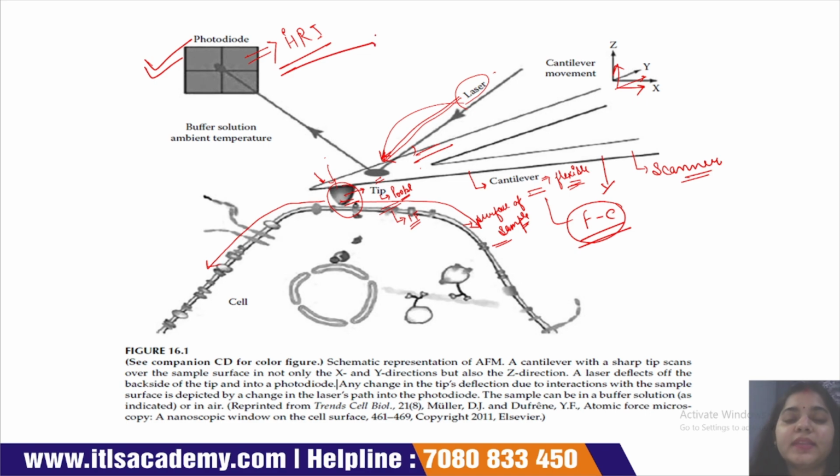Okay, this is the basic working of AFM. If we want to perform this scanning process in air or gaseous environment, we can easily perform it. If we want to perform this process in liquid or aqueous environment, we can easily perform it in both of these environments.